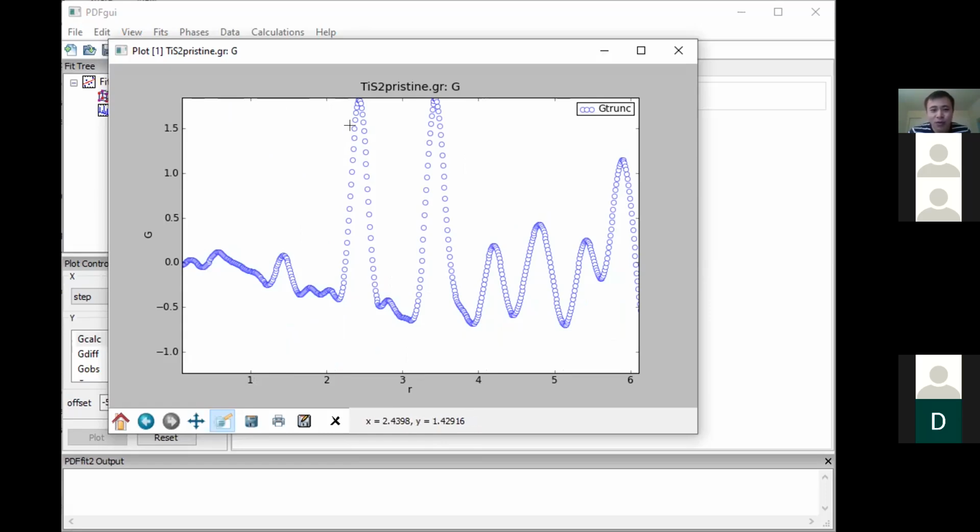If you compute the ratio of bond lengths between these two peaks, for example, this is 3.4 and this is 2.4, you get some number. In fact, you can calculate the bond angle of that local entity. I do not want to go into details, but if you think about it, you can figure it out. You can take my hint and go further. This kind of ratio gives you a hint of the bond angle, right? If you think about the triangle, that's the bond angle it will have. But anyway, let's get back to the data.